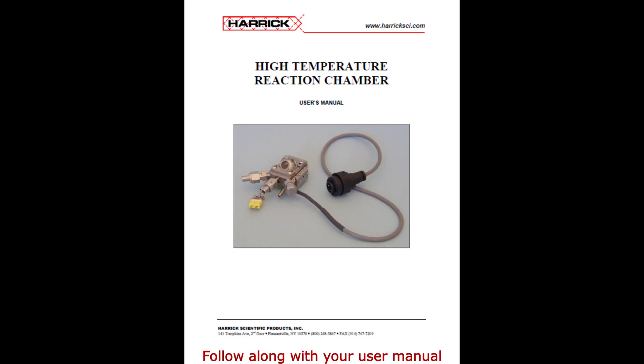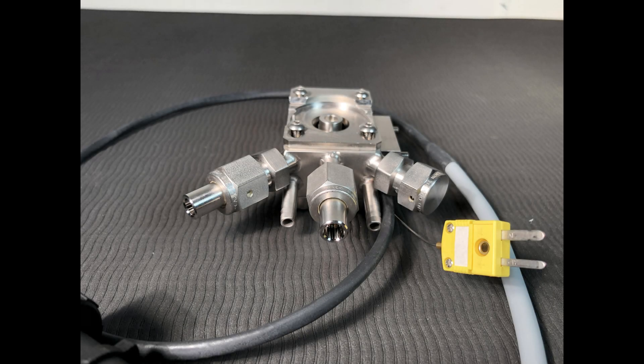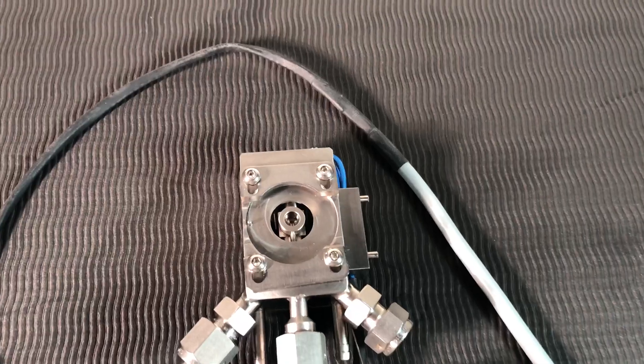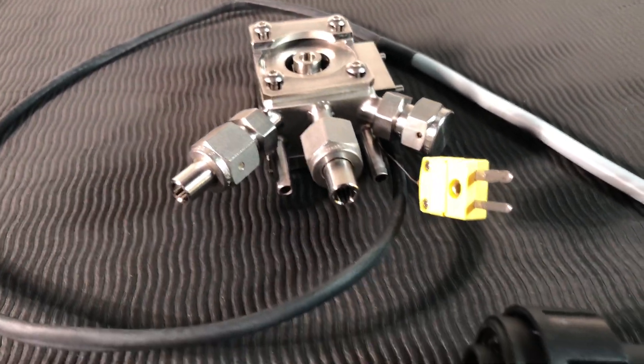In this video, I will be going over how to install, align, operate, and maintain the Praying Mantis High Temperature Reaction Chamber. The Praying Mantis High Temperature Reaction Chamber is used in conjunction with the Praying Mantis accessory for FTIR and UV-Vis Diffuse Reflectance Spectroscopy. High Temperature Reaction Chamber applications allow diffuse reflectance spectroscopic measurements under controlled pressures and a wide range of temperatures, making it a valuable tool for studying heterogeneous catalysts, gas-solid interactions, photochemical reactions, and oxidation mechanisms.